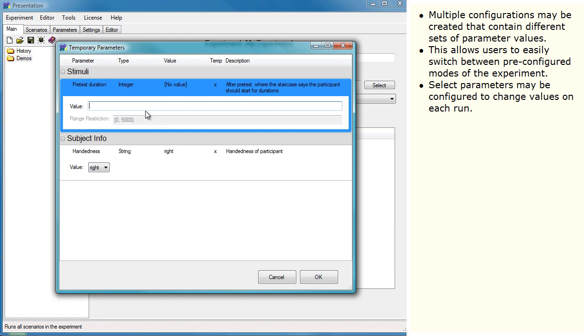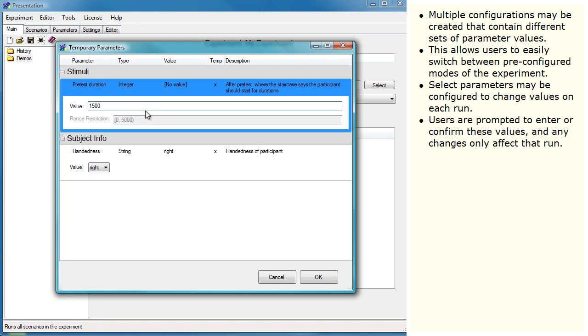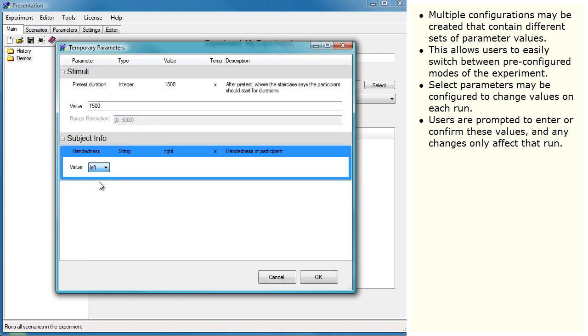Select parameters may be configured to change values on each run. Users are prompted to enter or confirm these values, and any changes only affect that run.